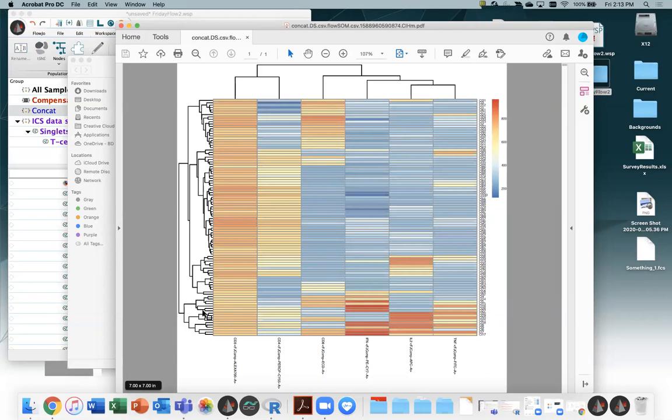But anyway, it's a way to certainly get within the ballpark. I'm thinking very clearly that the number is between, say, 14 and 17 clusters that we wanted to run. And we could rerun FlowSOM if we want to try it with a slightly different number and see what happens. But that's what that tool is for.